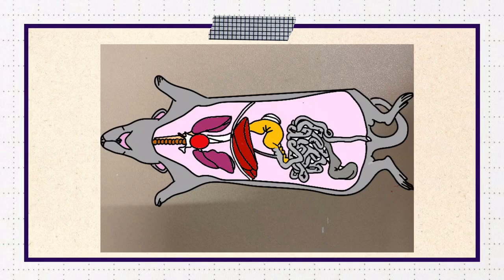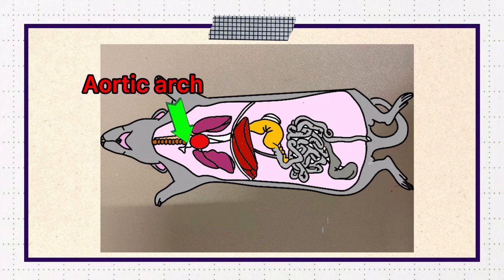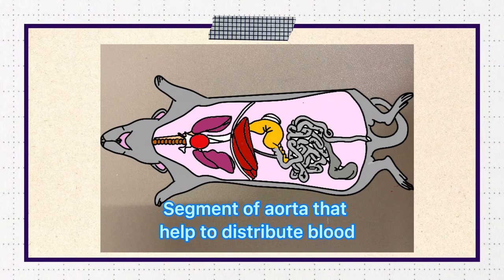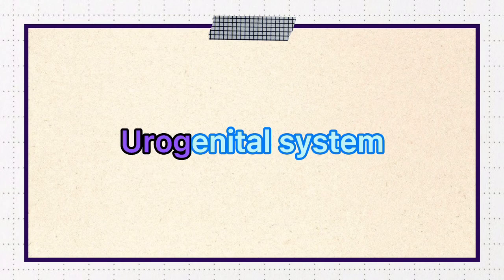Let's take a look at the circulatory system. There is the liver, heart, and aortic arch. The aortic arch is the segment of the aorta that helps distribute blood to the head and upper extremities.